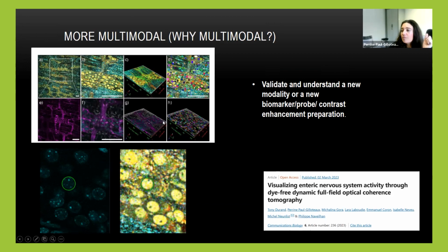And from this, we were able to demonstrate that it was actually only one type of cell which was shown in vibrational optical coherence tomography. And even if you zoom on some of these images, you can see, for example, that the dense areas in the nuclei, which are actually DNA dense also, are not vibrating, so they have no signal.